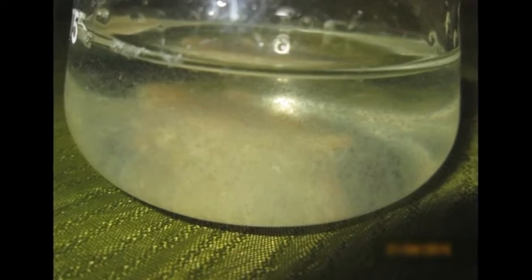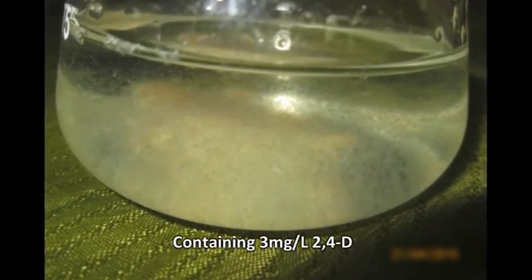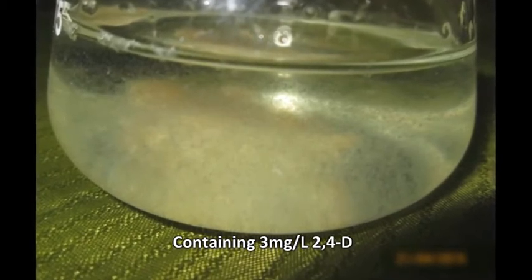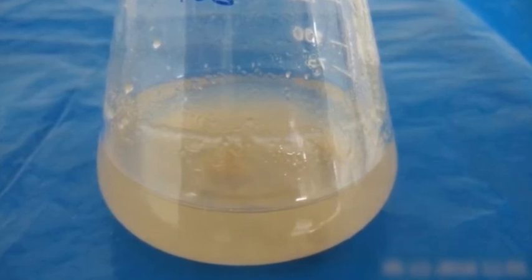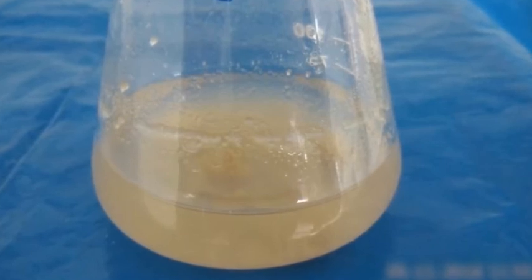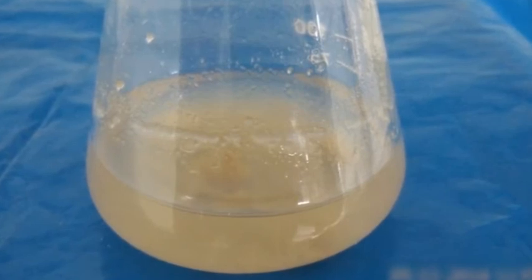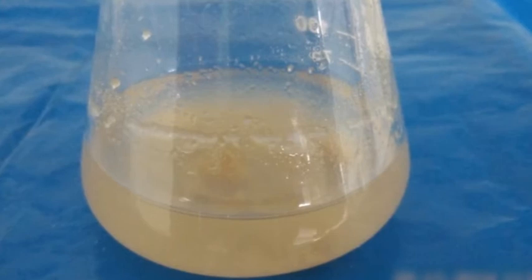Cell suspension cultures were initiated from the callus on liquid medium containing 3 mg per liter 2,4-dichlorophenoxyacetic acid, or 2,4-D. Cell suspension cultures were established by inoculating 0.5 gram of 4-week-old friable calli in 25 ml liquid MS medium supplemented with 3 mg per liter 2,4-D.